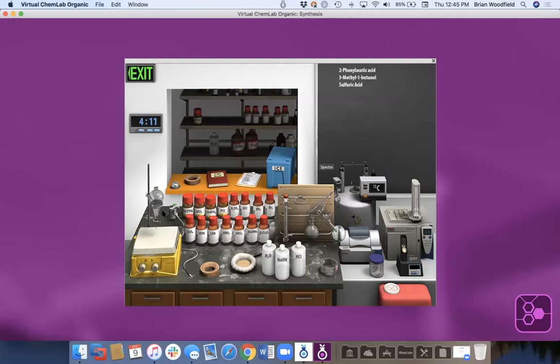What if they did something like that and they just stopped it right there, right? I have over here my product mixture, and then if I did my sodium hydroxide, it should pull my phenylacetate down into my aqueous layer and my butanol. And what if they drag the wrong one? They can drag the wrong one, and so I can pull my organic down here and just throw away the wrong one, or they can pull the water one and drag it here and have both copies here.